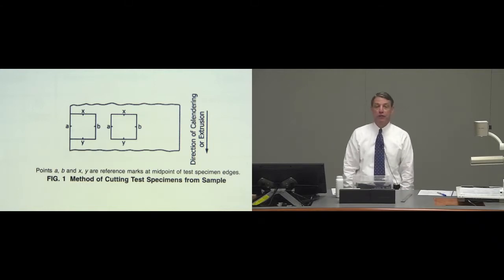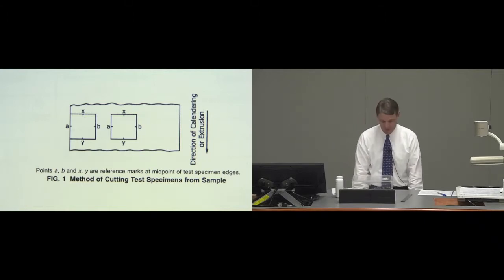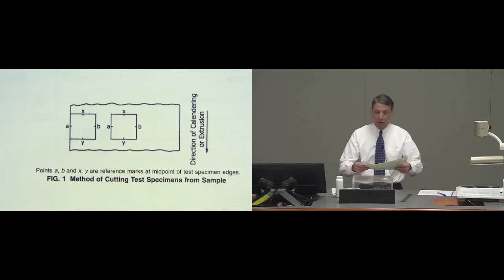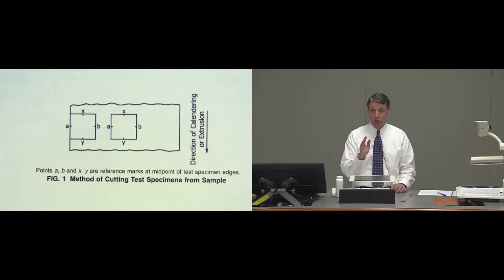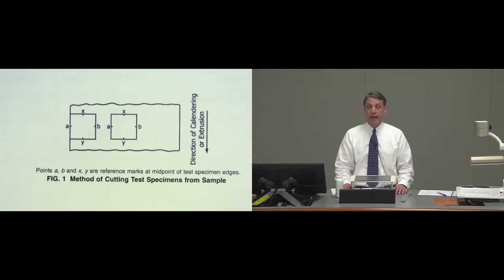After 15 minutes it is brought out and here is a specimen from the edge of the geomembrane roll that has been subjected to 100 degrees Celsius for 15 minutes. After it's brought out of the oven it is allowed to equilibrate for one hour.